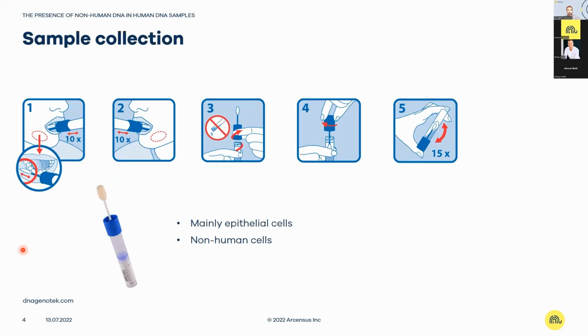instead of saliva, which is the other oral sampling approach. So for the buccal swabs, usually there is this device that is packed in a sterile package, and there are instructions usually provided to the individual who needs to do the sampling. And as you can see, the important device looks like this, that has a brush at the end, which is important to keep sterile, so do not touch it with your fingers.